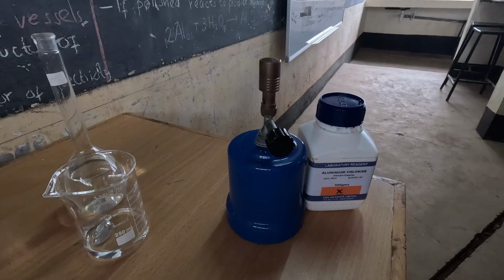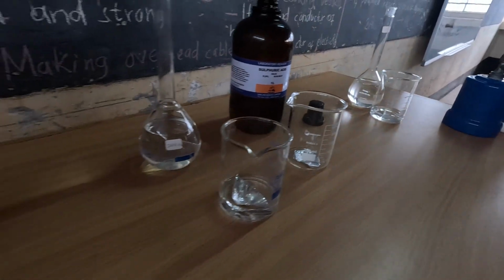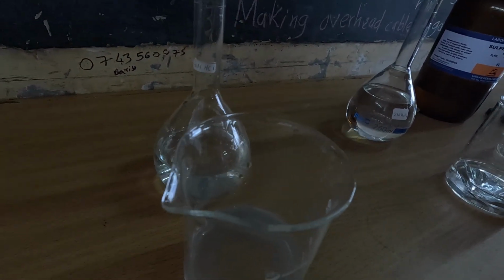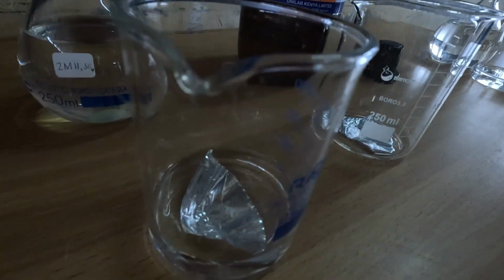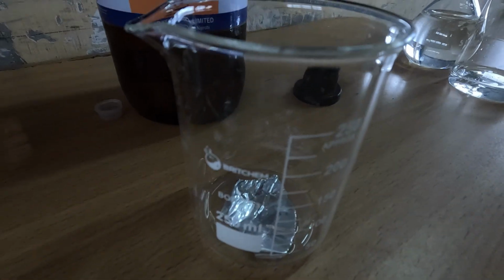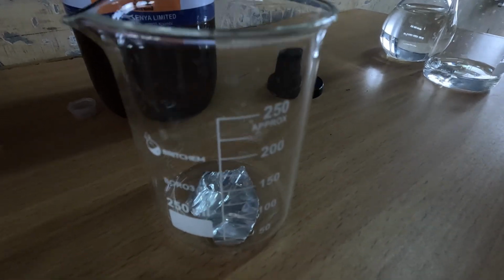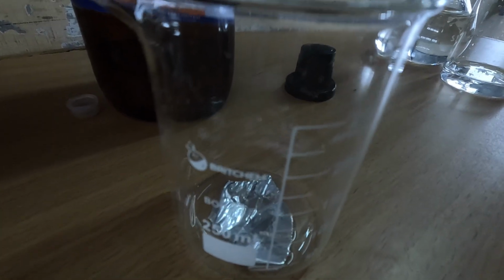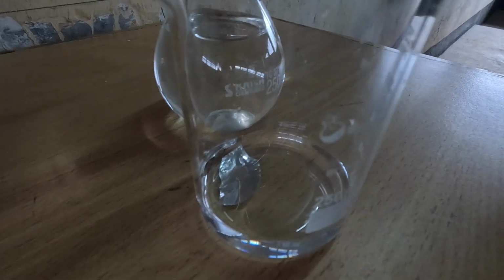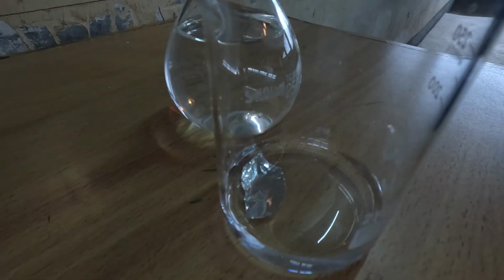So if you can look at the reactions, starting with the one for HCl, it is now done. Inside there it is aluminium chloride. The one for sulfuric, it has not yet started, because there is no apparent reaction. That is for dilute sulfuric(VI) acid. For the concentrated sulfuric(VI) acid, what is happening? It is reacting slowly because of the formation of aluminium oxide coating. Then the one for nitric, no apparent reaction due to the formation of aluminium oxide coating.